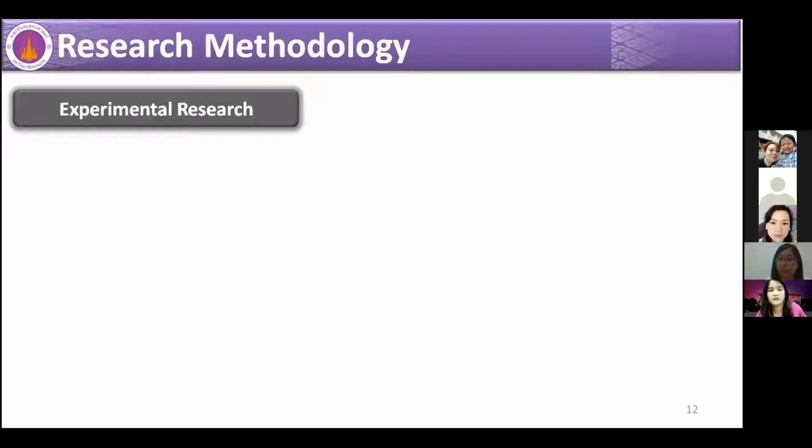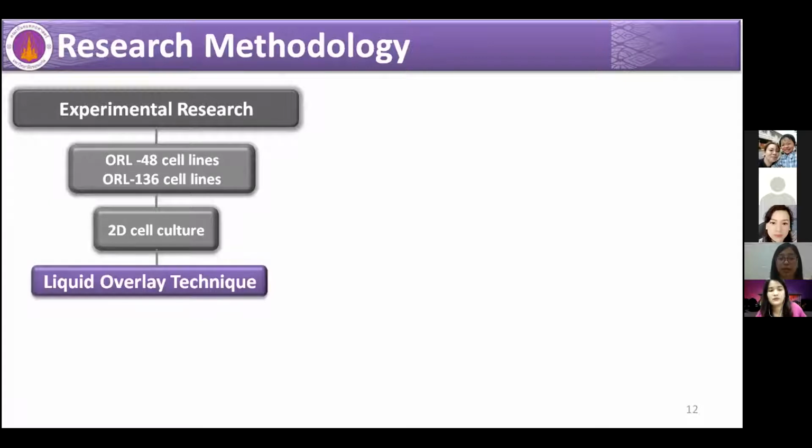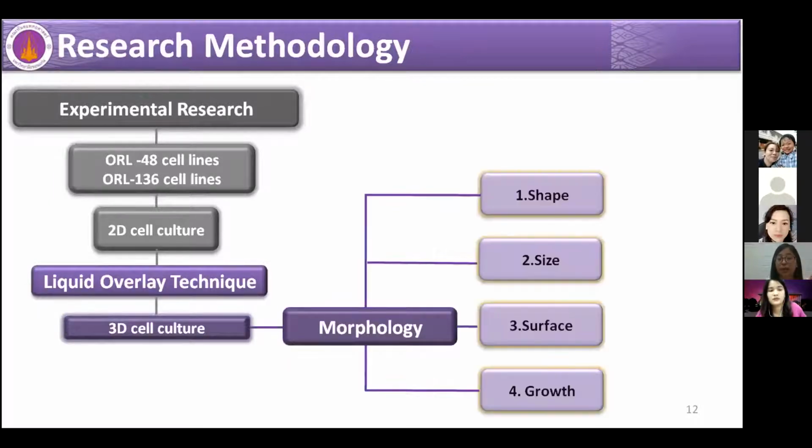So it is an experimental research whereby I grow these 2 cell lines as 2D first, and then I'll use the liquid overlay technique to grow as 3D. And then I compare their morphology based on shape, size, surface, and growth.